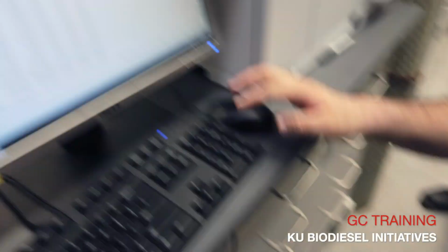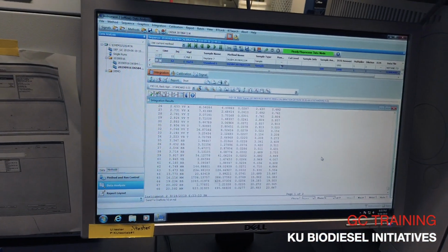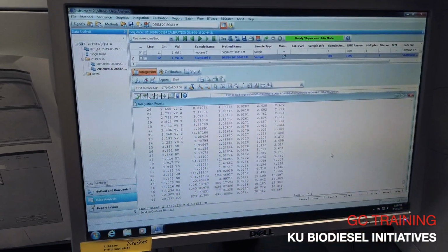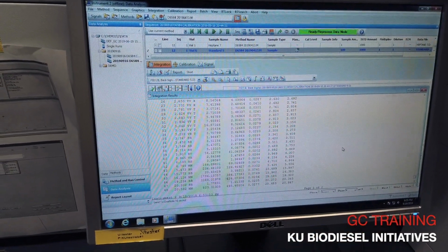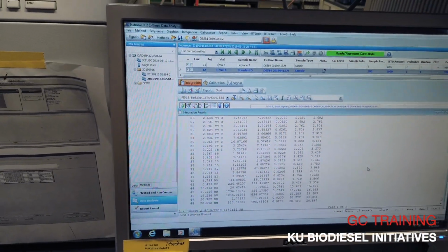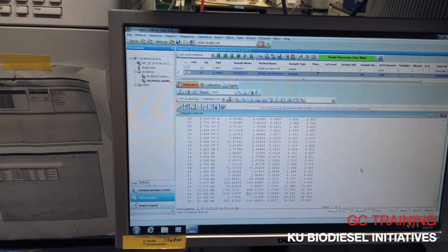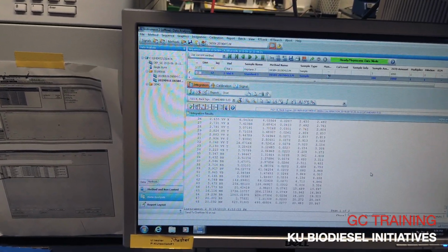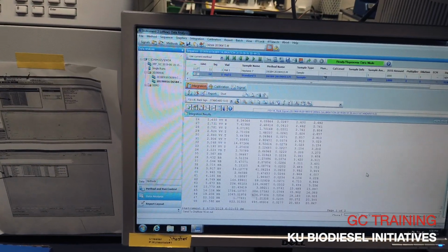Okay. You know that these are similar retention times because of experience? Well, the standards are all the same, they just have different concentrations. They're all pre-mixed, so they're all going to be the same thing, just different concentrations.